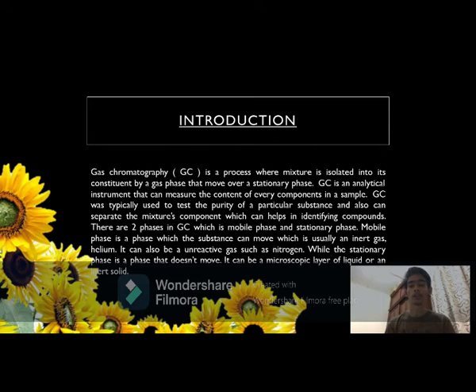Hi, I'm Zahirul. The introduction for this experiment: gas chromatography is a process where a mixture is isolated into its constituents by a gas phase that moves over a stationary phase. Gas chromatography is an analytical instrument that can measure the content of every component in a sample. It is typically used to test the purity of a particular substance and can also separate the mixture's components, which can help in identifying compounds.